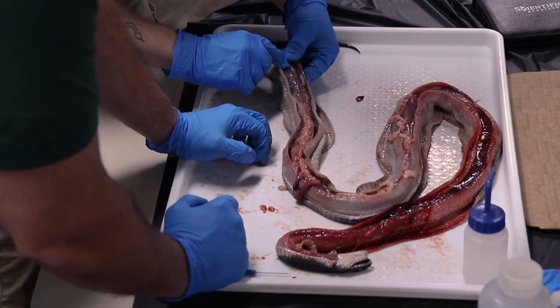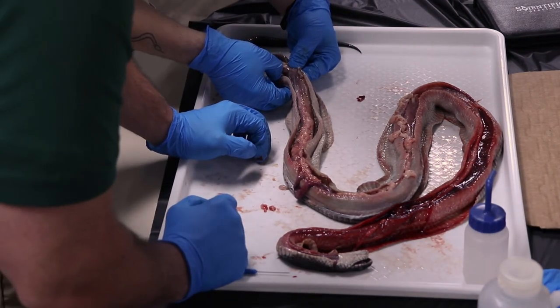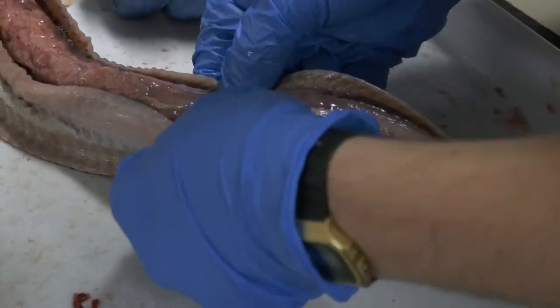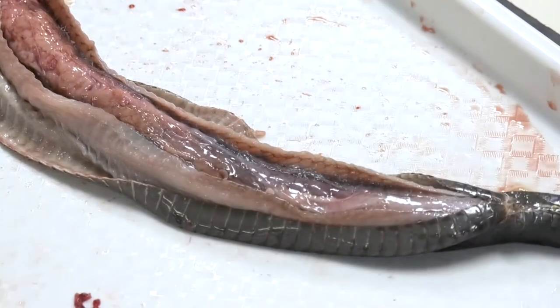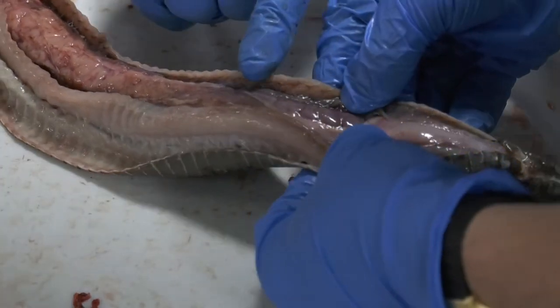Does this look like a kidney to you? I don't know. None of this looks like a kidney to me because I'm used to seeing nice mammal kidneys. Yeah, the picture looks very odd for a kidney. Is it long and skinny? Yeah. Oh, yeah. Okay. My goodness. Wow. It's not the same color, though. No, but... yeah. Don't know if that's large intestine or kidney.